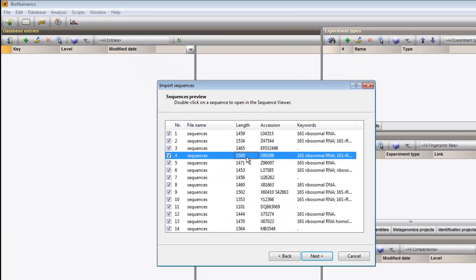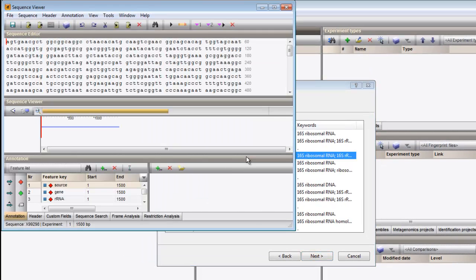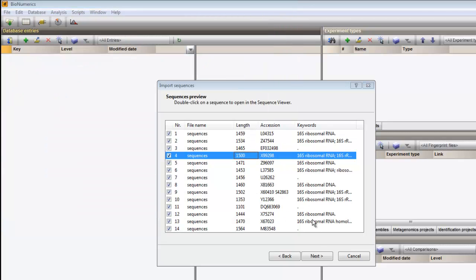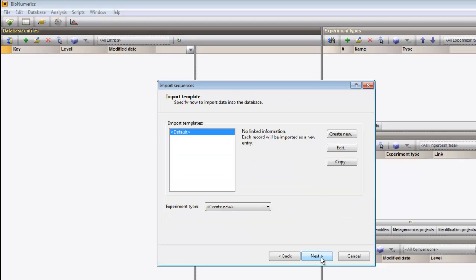Double-clicking on a sequence opens the data in the Sequence Viewer window. In the next dialog, we will create a new import template for this kind of file format.